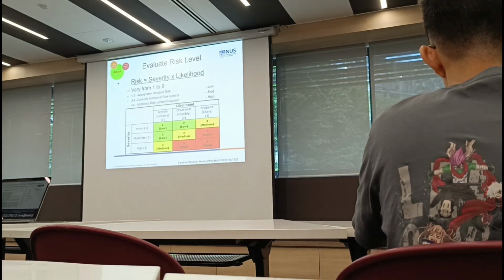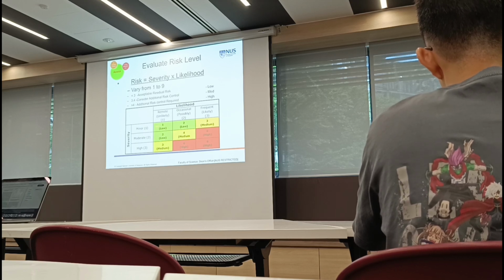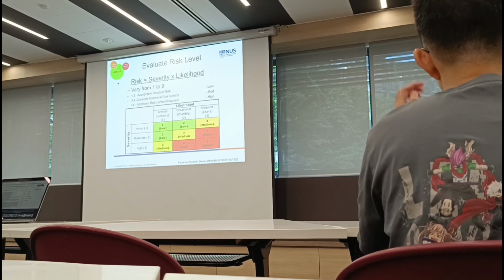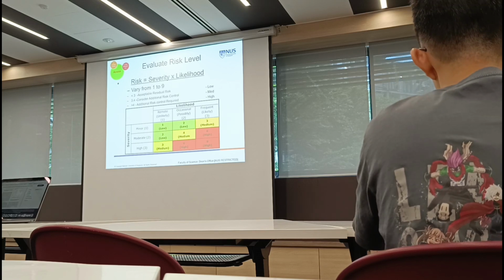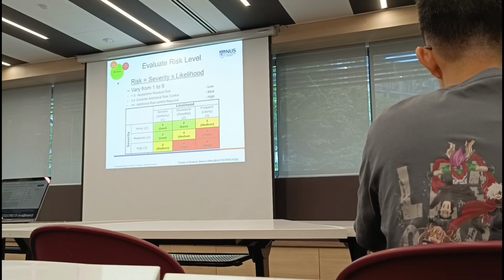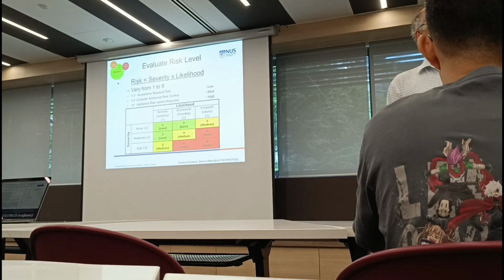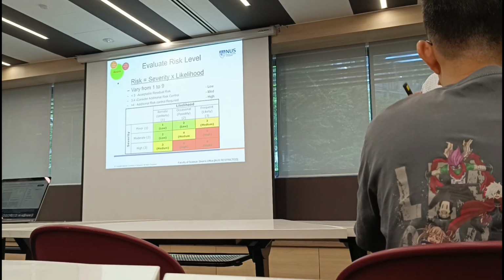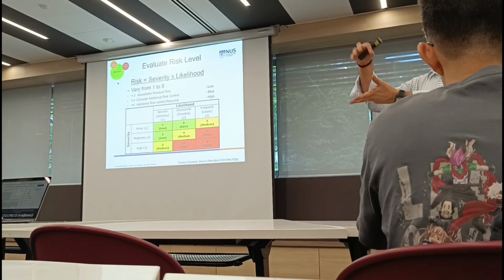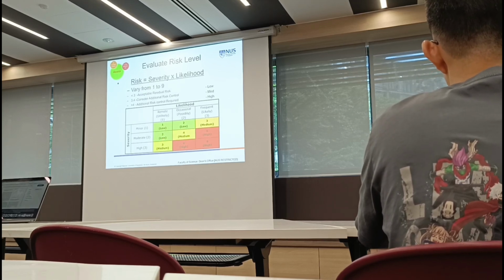Even the medium ones are kind of safe, but you should not go ahead and do it like this one, right? The minor one. You should have extra precaution. Somebody else should be aware of what you're doing. Some additional control should be there. If a fire breaks out, what am I going to do? Do I know where the fire extinguisher is, or do I have a mechanism to put it out? All those things you need to think about when you work at the medium level. Okay, medium is 3 or 4, right?